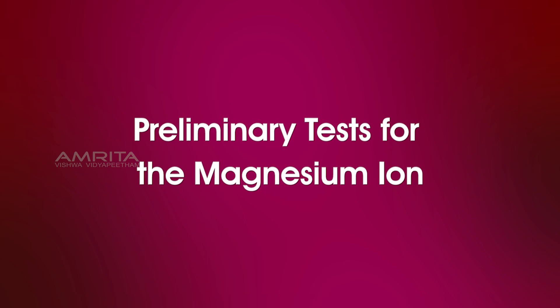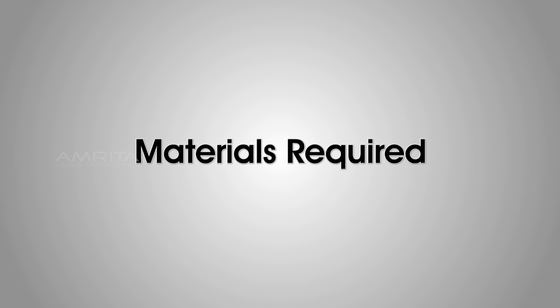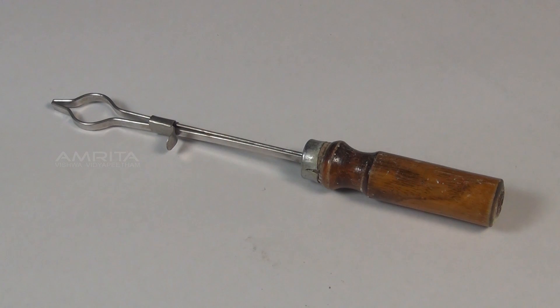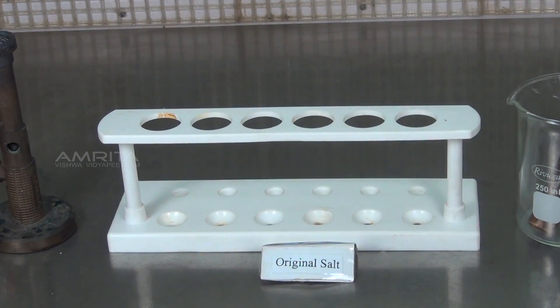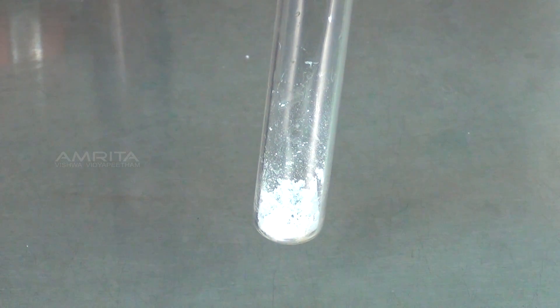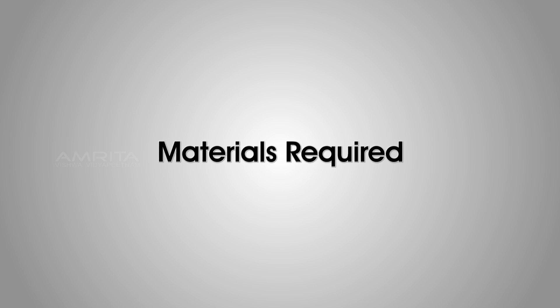First, we look at the preliminary tests for magnesium ion. Dry Heating Test. Materials required: original salt in a test tube, test tube holder, and Bunsen burner. Procedure: Take a small quantity of salt in a test tube and heat it over the Bunsen burner. A white residue that glows on heating indicates the presence of magnesium ions.